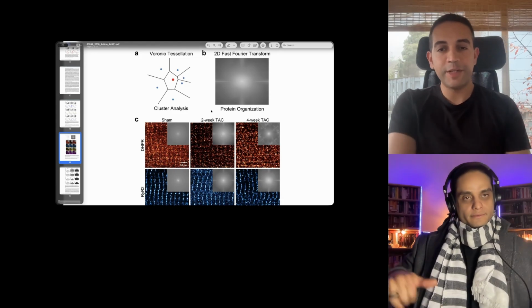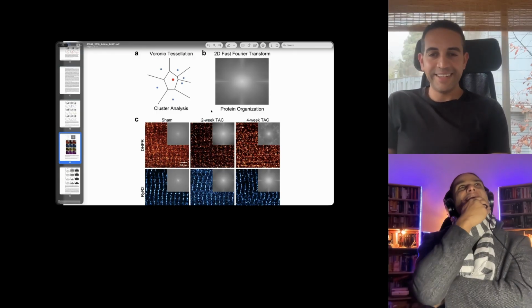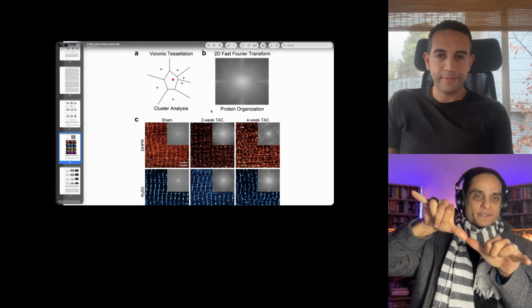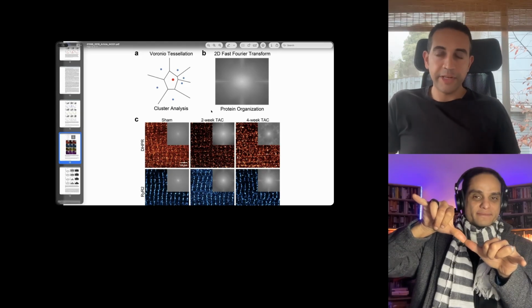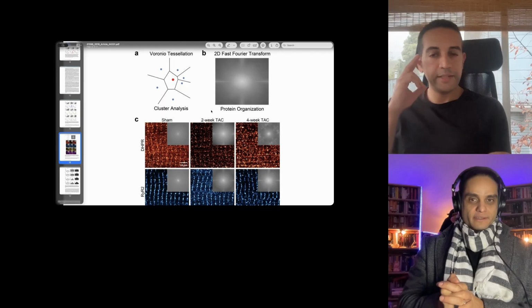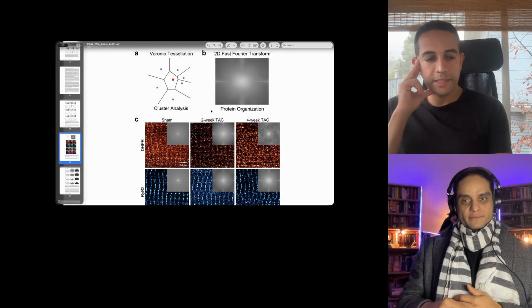So now you can talk to us about epitopes if you want. We could do that. But it's conjugated antibodies, right? Well, in this case, the primary antibody is not conjugated. We then add a secondary antibody to amplify the signal. I see, so that you have enough to resolve.